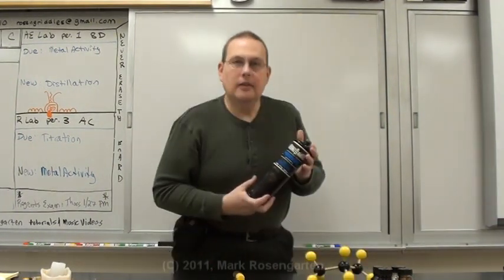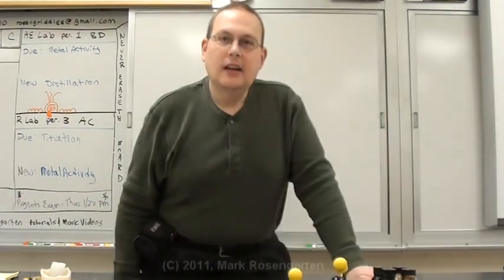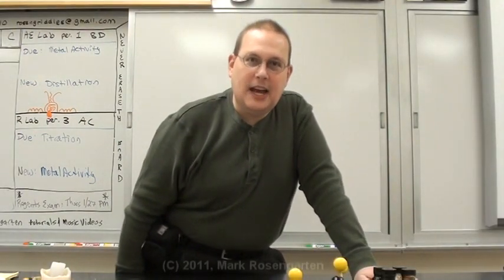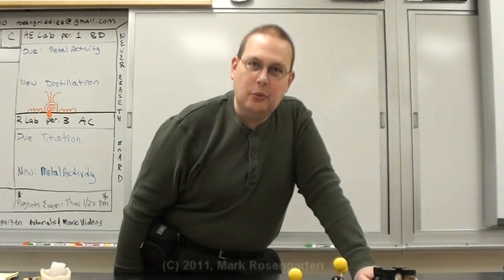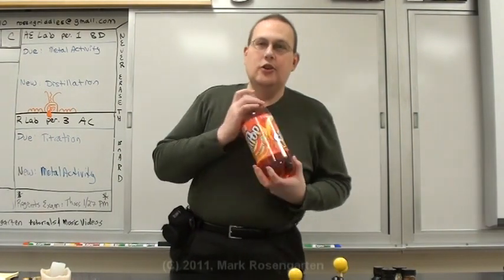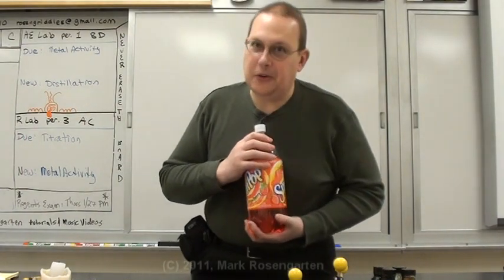And propane, it's only a liquid at room temperature if you keep it under a lot of pressure. Now, since crude oil is fairly volatile and fairly toxic, to do this lab today, instead of using crude oil, we're going to substitute strawberry soda. See, strawberry soda's got many different ingredients.